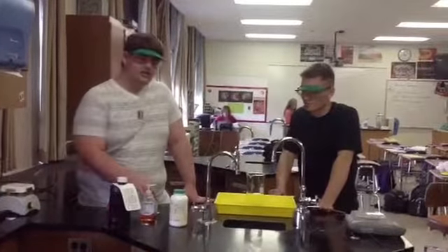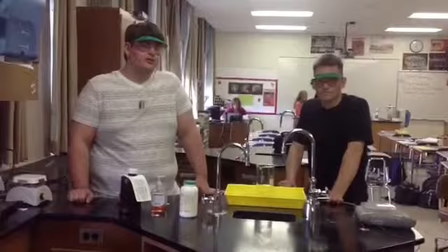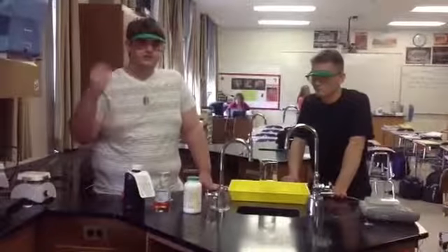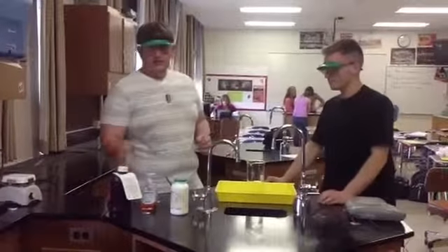gas. To see the effects, we have a sample of soap that will be mixed in with the reaction. The soap will bubble with gases that are produced instead of just vapor going into the air. Creates a very interesting foam. Should we begin? Yep. So first we add the hydrogen peroxide.